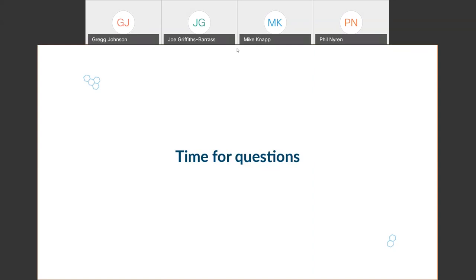Okay, thanks, Phil. We've probably got time for one or maybe two questions, depending how we answer. Someone's asked about tubing splits, and if there's any kind of monitoring system that detects if tubing is split or if they've got a leak. So is there a way of remotely detecting, I guess is the best way of rewording that question, if tubing is split or has a leak?